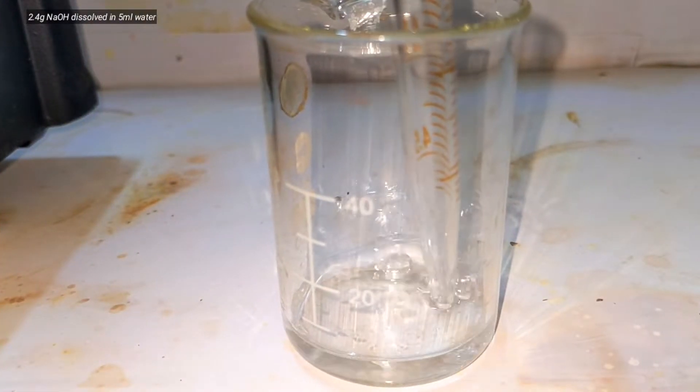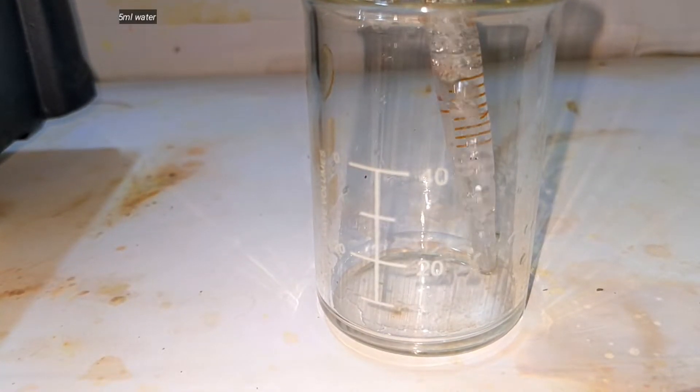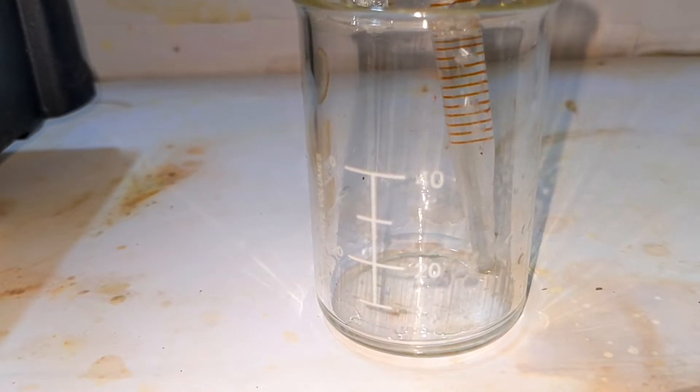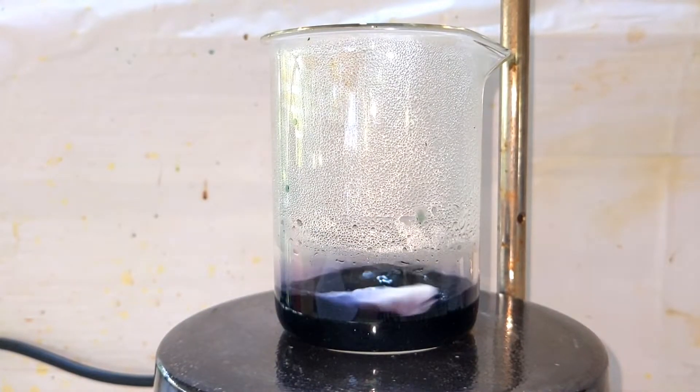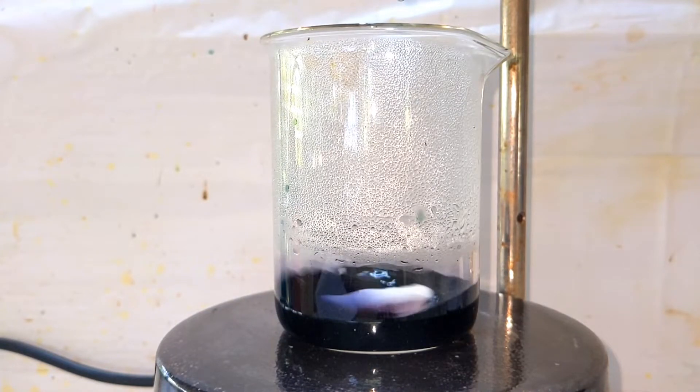Now we take the sodium hydroxide solution, which we had made by dissolving 2.4 grams of sodium hydroxide in about 5 milliliters of water, in a pipette. The mixture in the beaker was then heated up with stirring and the sodium hydroxide solution was added into it.